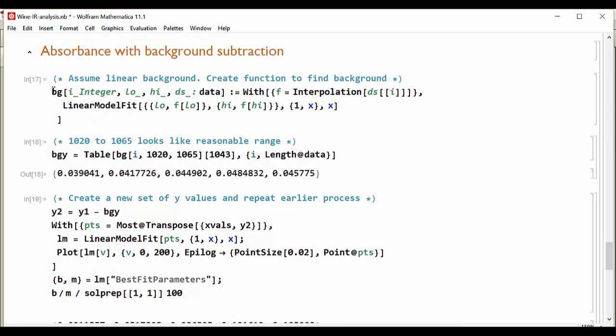So we create a background function which again uses the interpolated data, finding a linear model fit between two points, low and high. From that previous example, we see that the peak is encompassed by the wave numbers 1020 and 1065. So we create a straight line between 1020 and 1065 and we get the individual backgrounds, and they are around 0.04, which is what I was expecting.